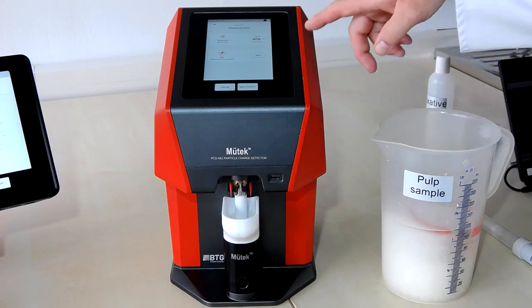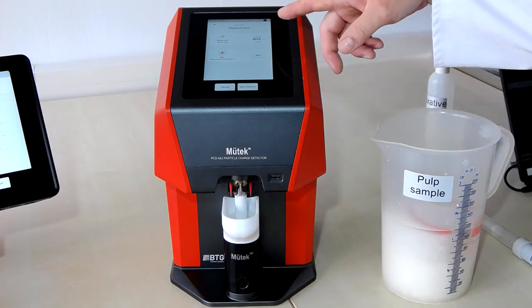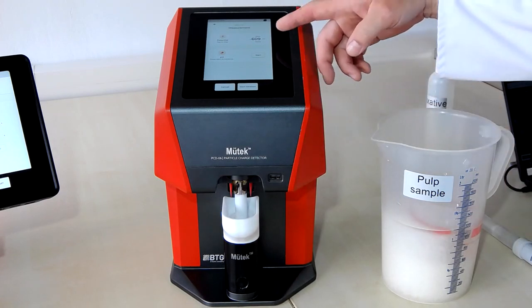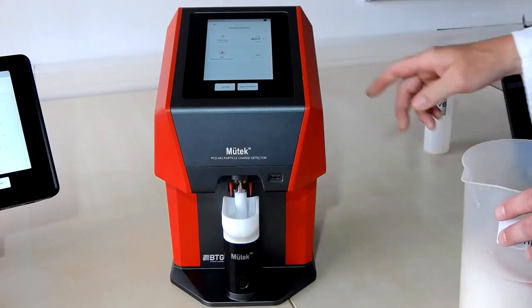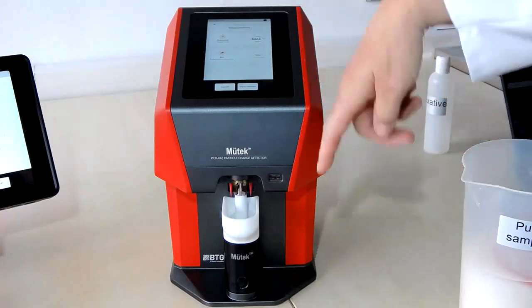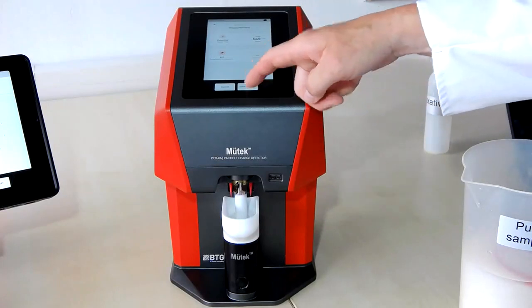And here we are measuring a streaming potential of roundabout -610 millivolt. What the instrument will do now is take note that it's a negative charge we are measuring here. So it will take the oppositely charged polyelectrolyte from the titrant and inject it into the measuring cell until this negative streaming potential is neutralized.